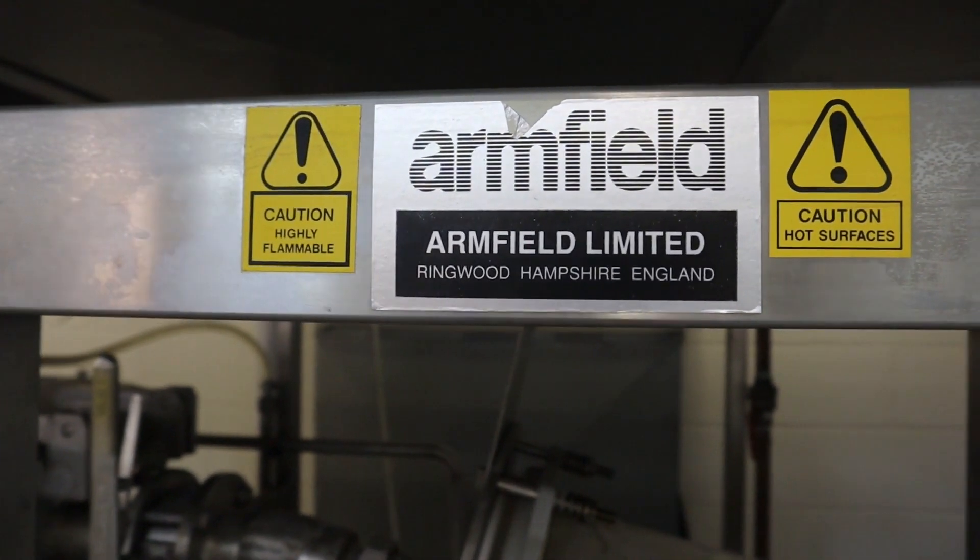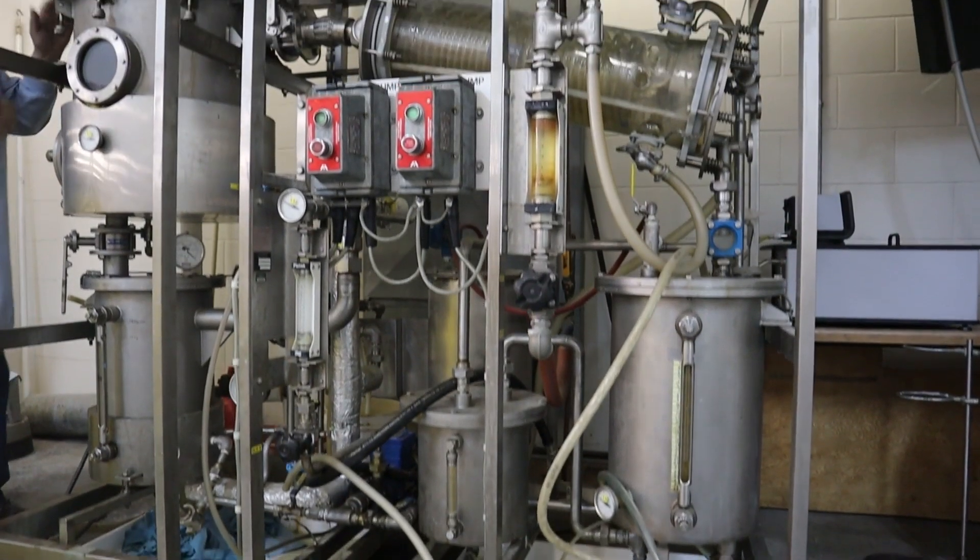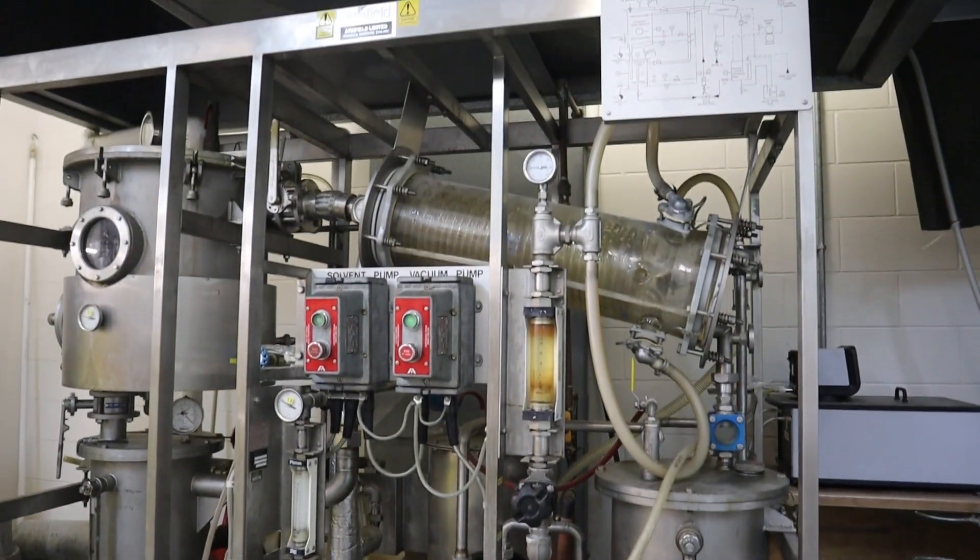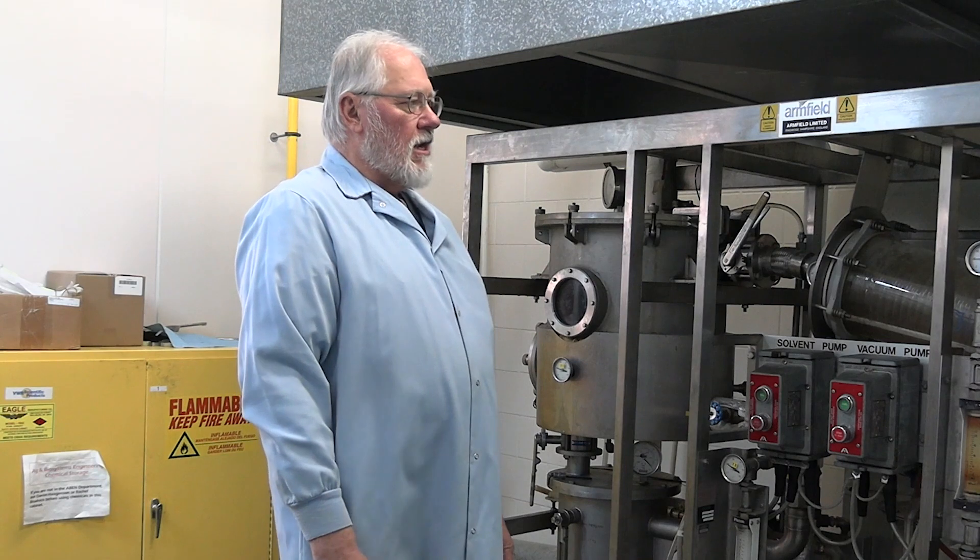I do a lot of different projects. One of them is working with our Armfield Solvent Extracting Unit over here, most commonly using soybeans as a product. I can do along with hexane in this unit. We also use alcohol in some cases, but in this case with soybeans as a rule, it's hexane.